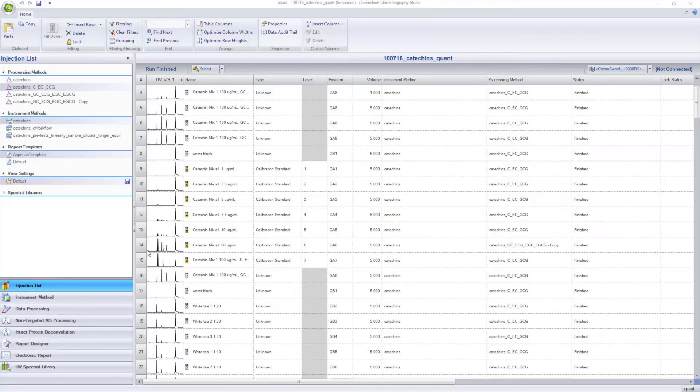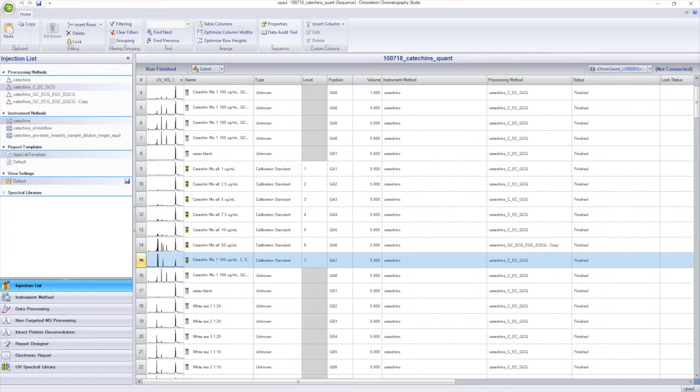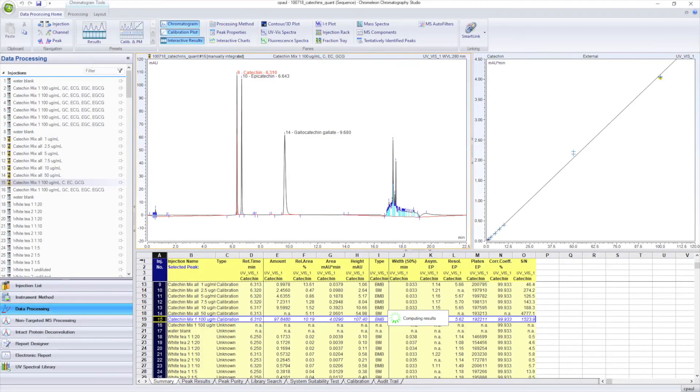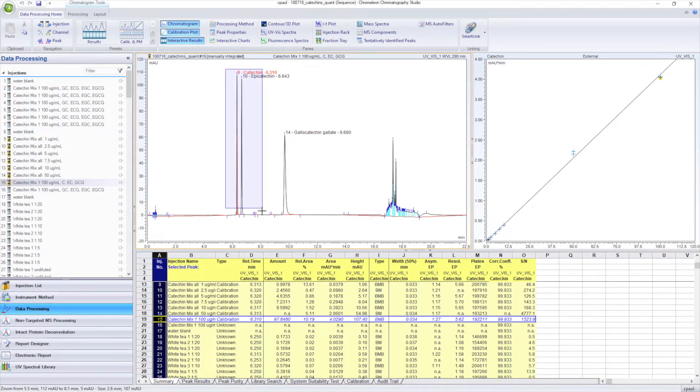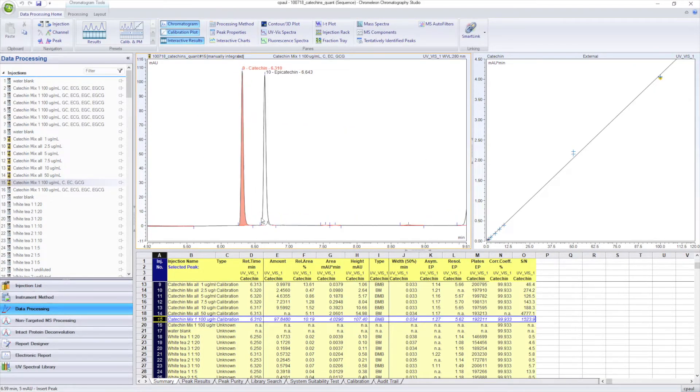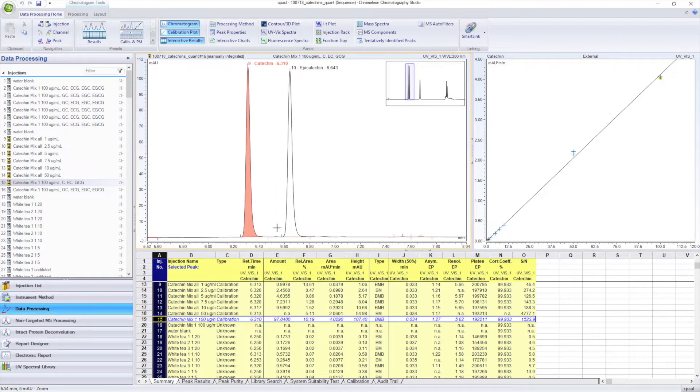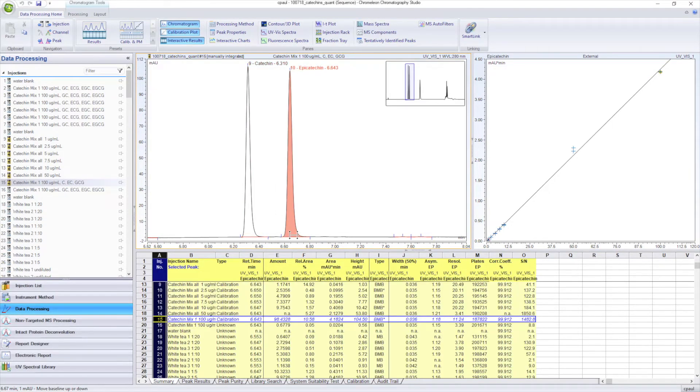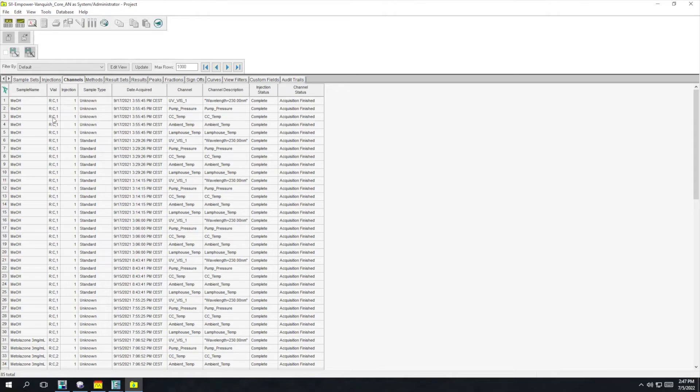The Thermo Scientific Chromeleon Chromatography data system software provides Vanquish users with the most advanced and intuitive software available for LC and LC-MS instrument control, data handling, and reporting.